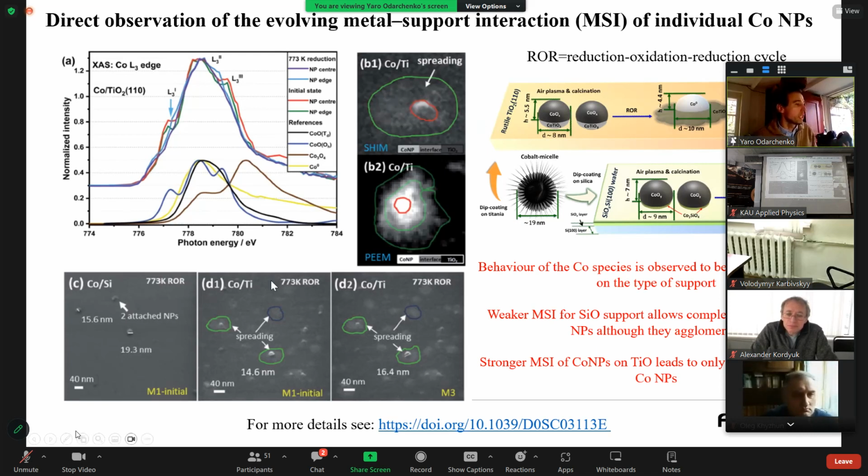And essentially, the thing that I mainly wanted to show here is that you could use just PEEM, which is microscopy. You get your spectra at each single point, but then you actually don't know the real size of the nanoparticles.